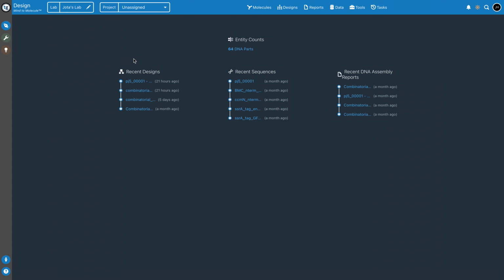After companies start working and need more complex data management, they might start adding distinct labs. A common example might be different academic labs within a single department, or different groups within a larger company that must work on distinctly different projects for customers that require data isolation and security.